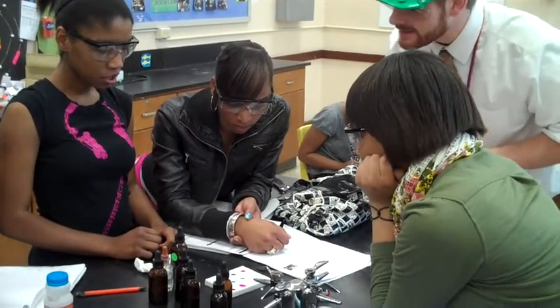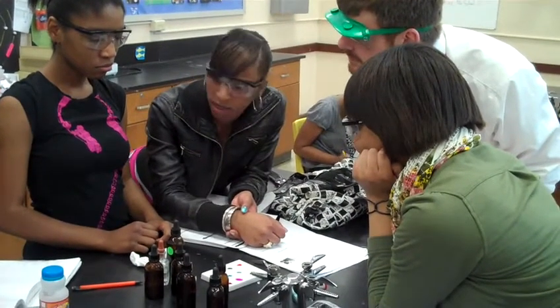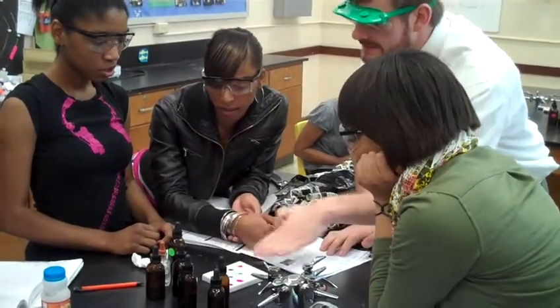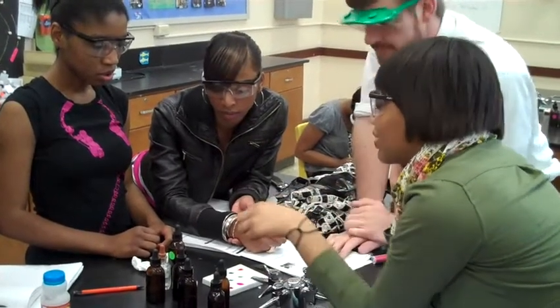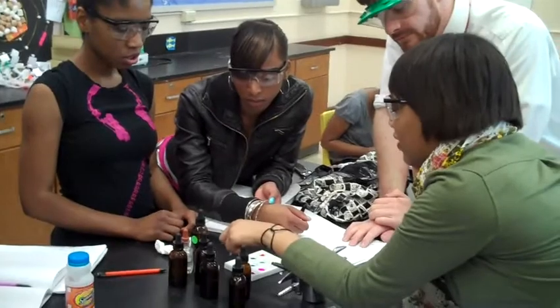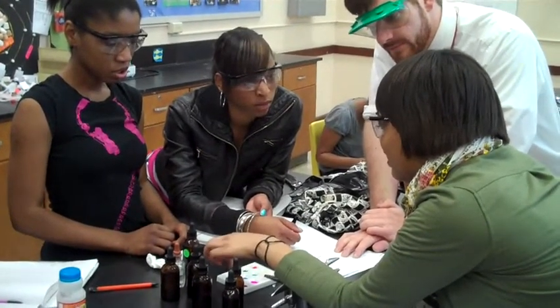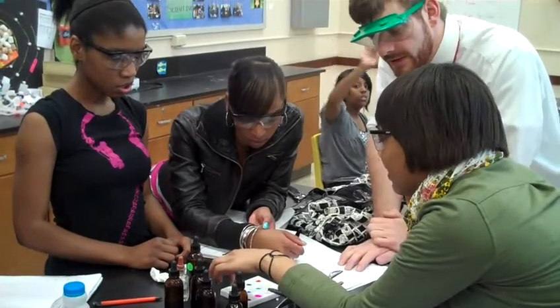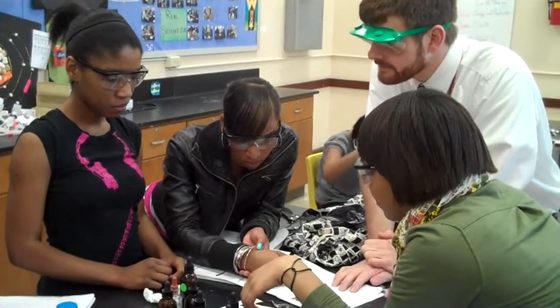You've got two minutes. See if you can rinse this out and retest those two. Use the evidence that you have right here to support whether you believe it's a base. Well, Mr. Good, when we first put in the unknown, it turned pink. Interesting. So we had to wash it out, and then it turned the clear color again. Maybe the unknown has something to do with it. Yeah, I would agree, and write that in your reasoning.